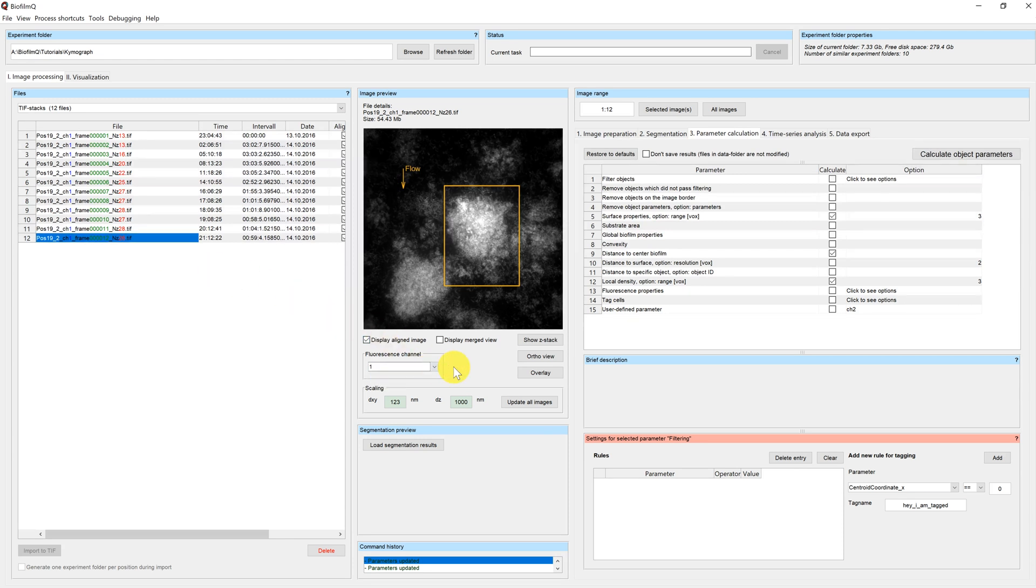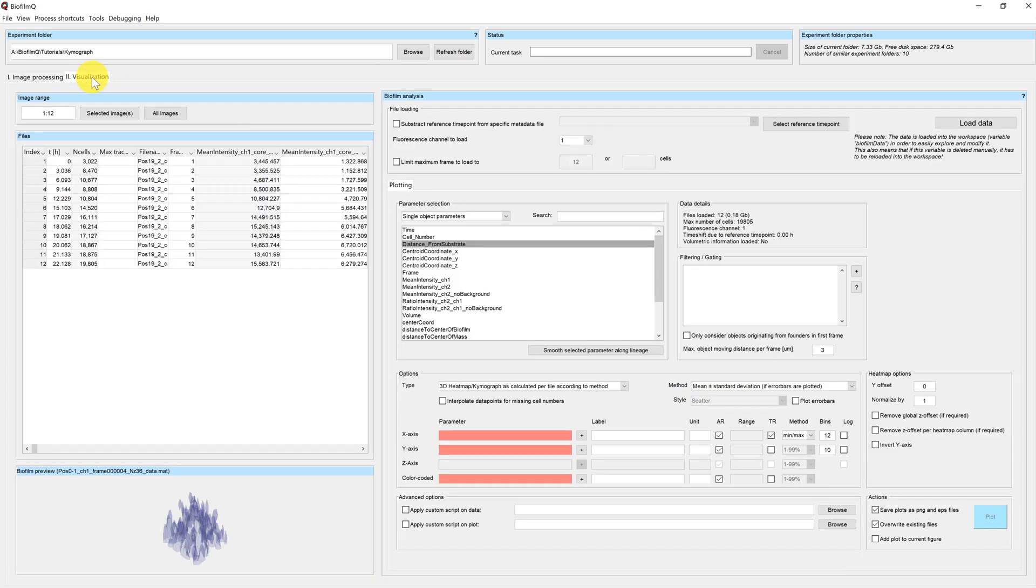One channel corresponds to a constitutive reporter, which we use for segmenting the files. The other one is a gene expression reporter. And today we want to find out what the activity of this reporter is depending on time and in space.